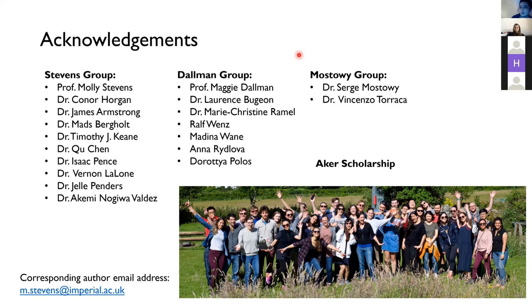The one thing to keep in mind there is that in both cases you are detecting light, and fluorescence is by far the stronger phenomenon, which means that if you try to detect Raman spectra and fluorescent signal in the same wavelength, you will only see fluorescence. So background fluorescence is an issue in most Raman imaging. There are ways to deal with this.